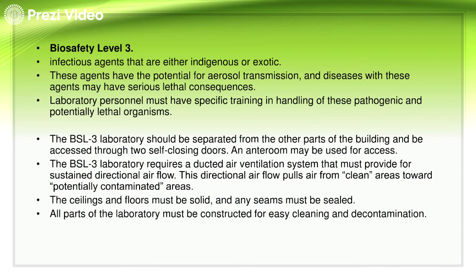And then, for the biosafety level 3 naman, kailangan mo ng ducted air ventilation system. Ibig sabihin niyan, yung airflow sa lab, controlled mo. Kumbaga, yung papasok na air sa lab, and then yung lalabas na air sa lab should be clean. Okay? So, mayroong mga HEPA filter yan. So, the ceiling and floor must be solid and any seams must be sealed. Kasi nga, hindi pwede na may lumilipad dyan na air, di ba? Dapat nga, controlled ang airflow. Also, all parts of the lab must be constructed for easy cleaning and decontamination. So, ano example of that?